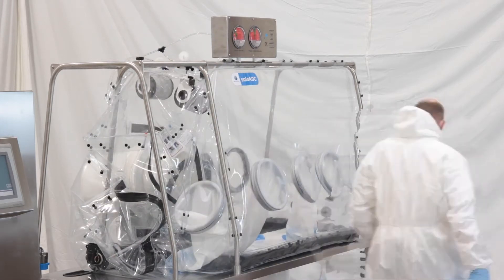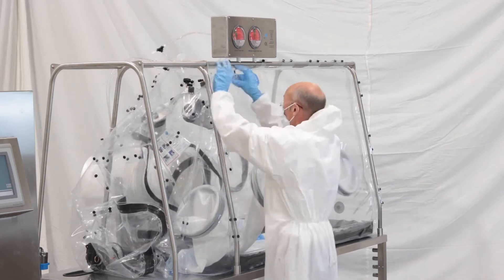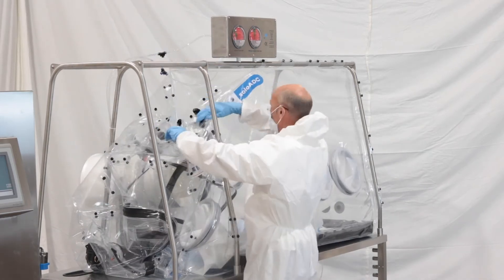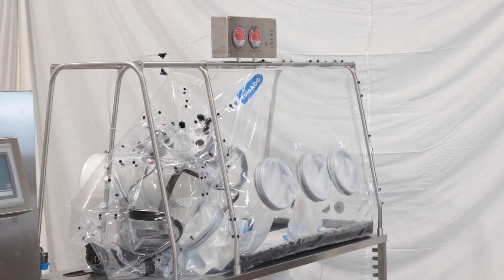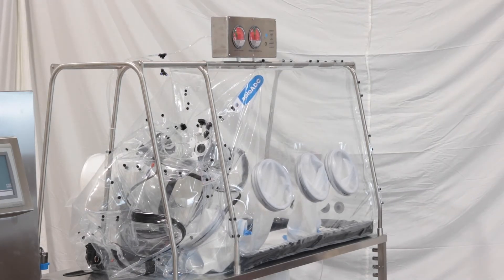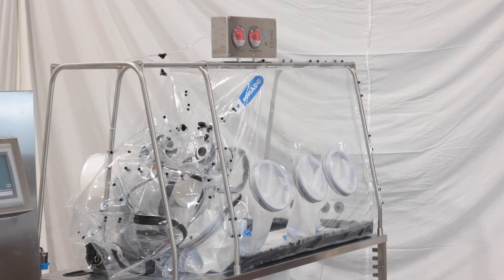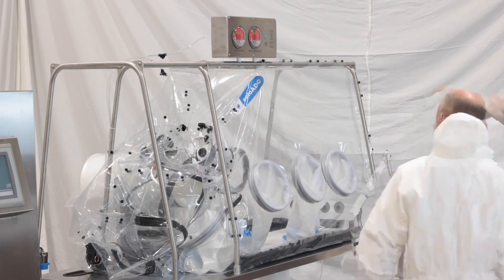Next you uncouple the transfer HEPA filters from the stainless steel support frame and remove further flexible film tabs. This will allow more contaminated air within the process chamber to be exhausted through the double HEPA filter system located in its own dedicated canister below the table.